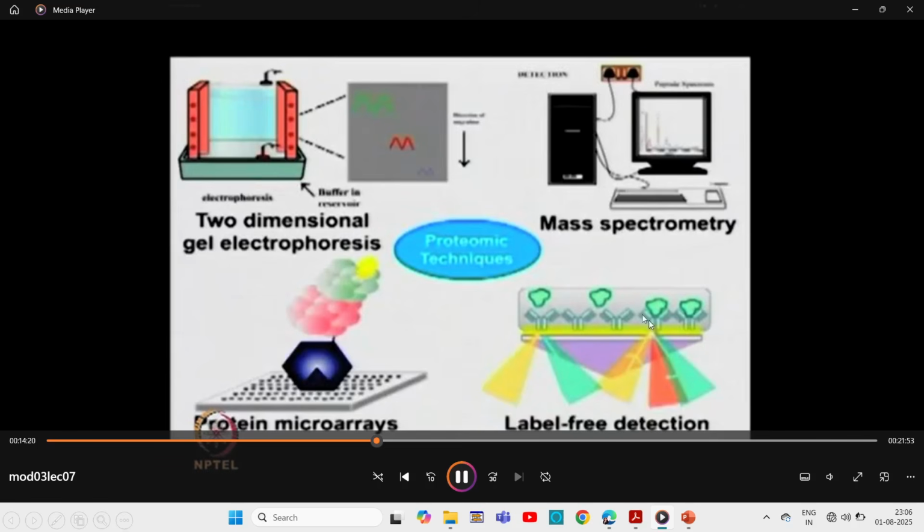Here, this is called a label-free technique. You are not using any label. It's the light which gets deflected depending upon the interaction taking place. If there is no interaction, it is one thing, and after interaction, it changes. That's how you can determine whether your protein of interest is present or not, and if it is present, how much of it is present, etc., without using any label. So it is not affecting your protein as such, and I can still analyze your protein.